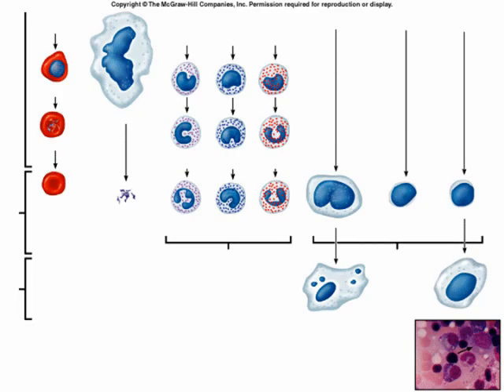In this recording, we'll be looking at blood through the microscope. Before we get started, I really want you to look on page 289 in your lab book. This is in exercise 37 on the blood. In this lab book, you see lots of examples of micrographs of the individual white blood cells. Before we start looking at those individually, I'd like to look at just blood overall.